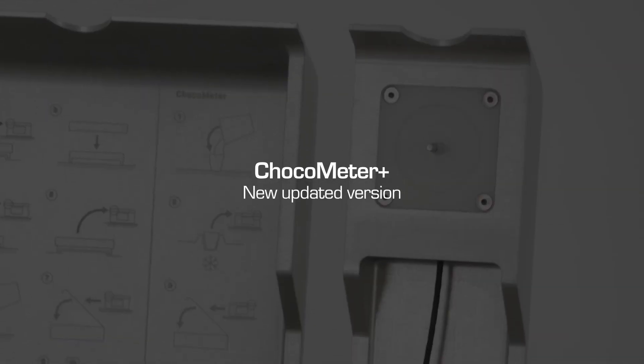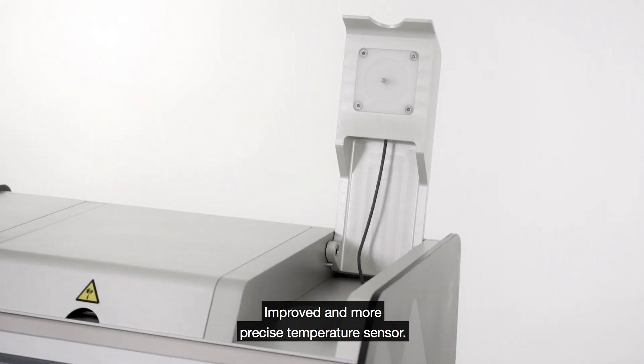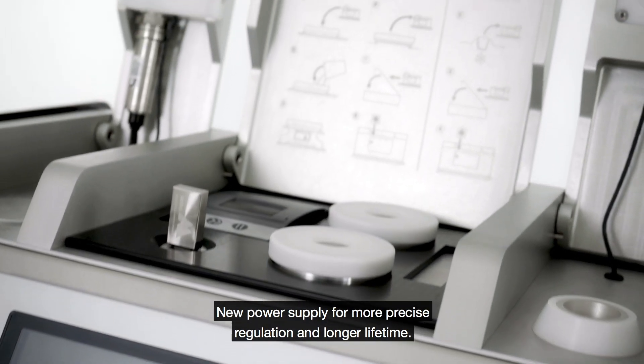ChocoMeter+: the new updated version of the classic temper meter. Improved and more precise temperature sensor, new water-cooled cooling cell for a longer lifetime, and a new power supply for more precise regulation and longer lifetime.